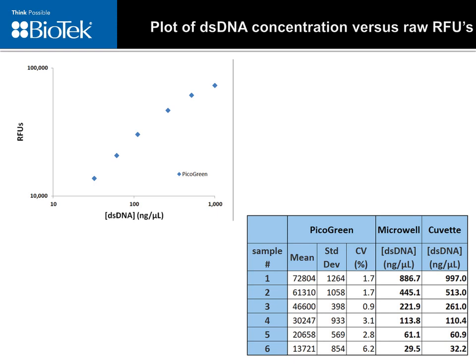And again, if we look at our plot versus RFU, we see excellent linearity up to the high hundreds of nanograms per microliter, which is again in the typical linear working range. This assay can be modified based on the concentration range needed by the customer. In this case, we were using the lower range, up to several hundred nanograms per microliter.